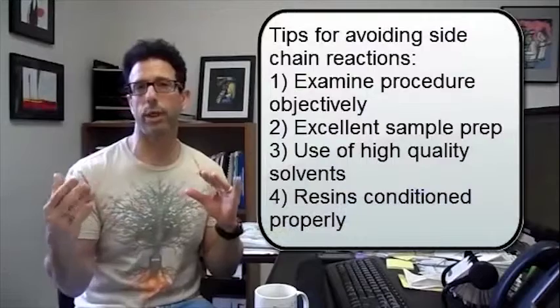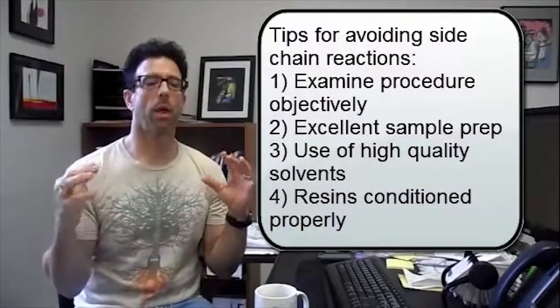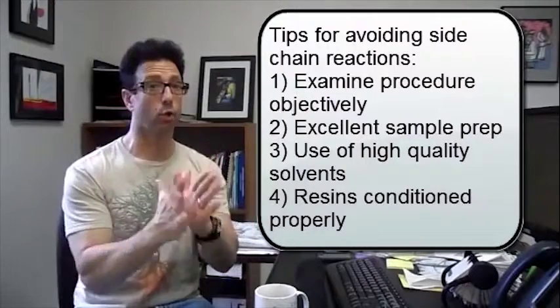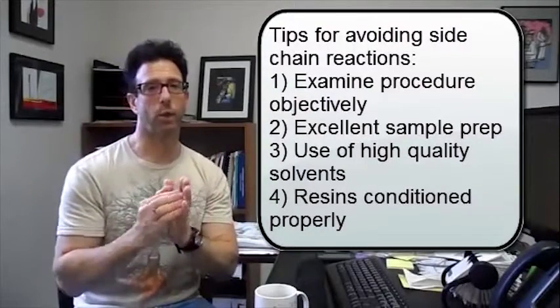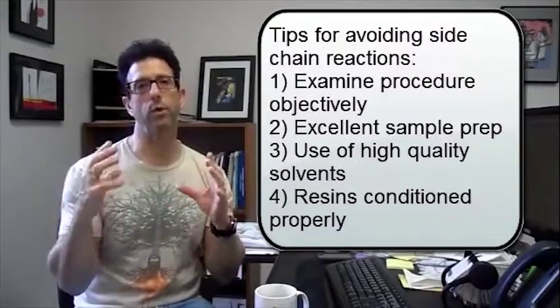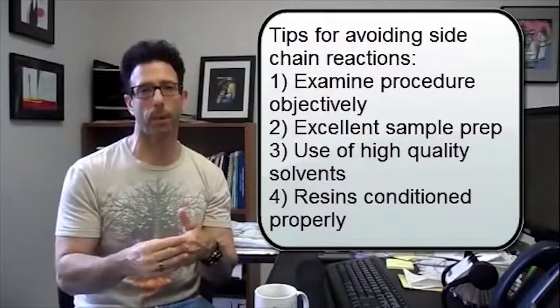Here are some thoughts we have on ways to help alleviate side chain reactions, because what we want to do is give you some tips. First of all, it comes from really looking at your procedure — making sure that you do great sample prep, making sure that your solvents are very high purity, and also that you condition your resins properly.